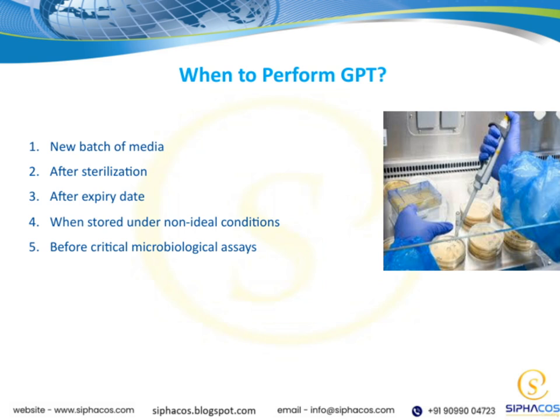In essence, these timing points are all about ensuring the media's quality and reliability at the right moments, which ultimately supports the accuracy and success of your microbiological work.